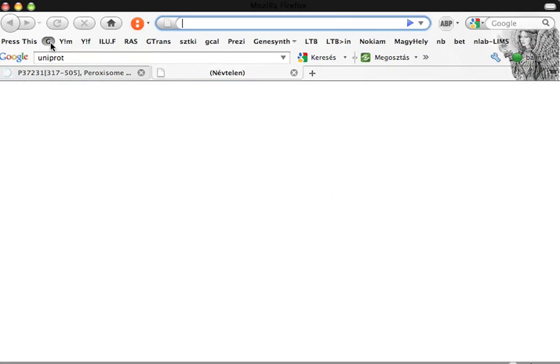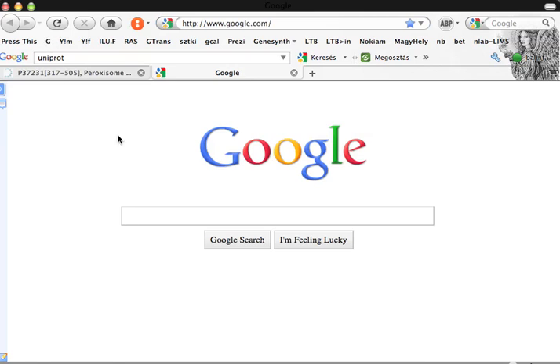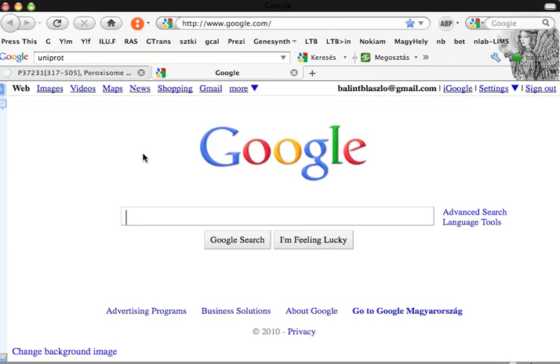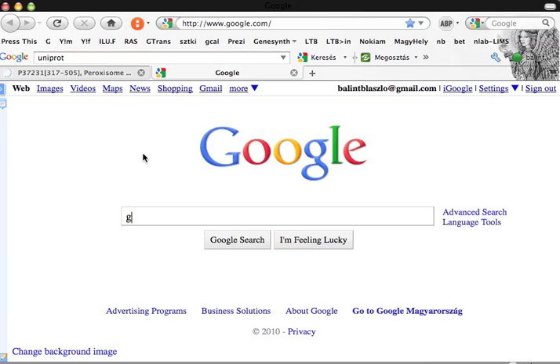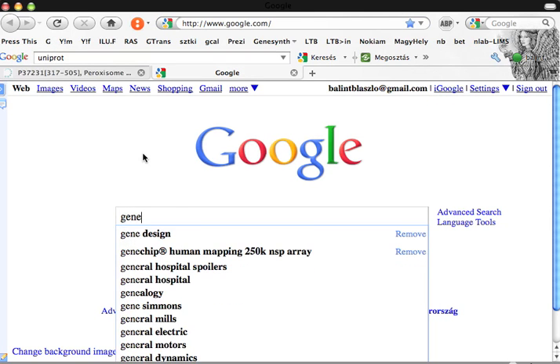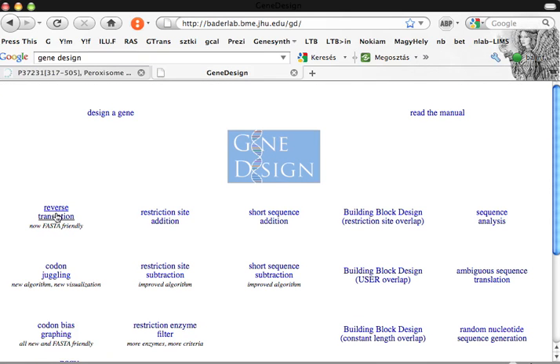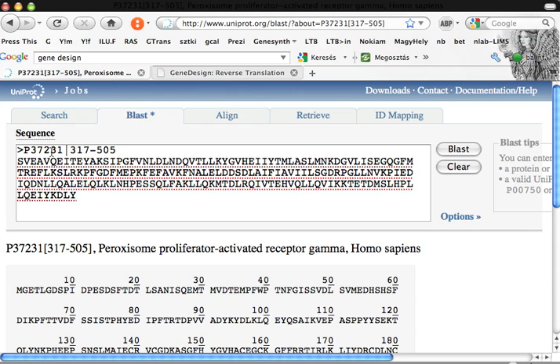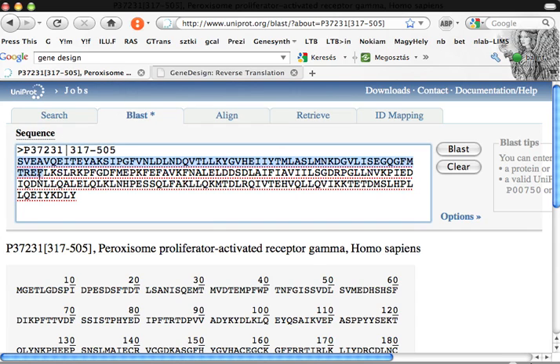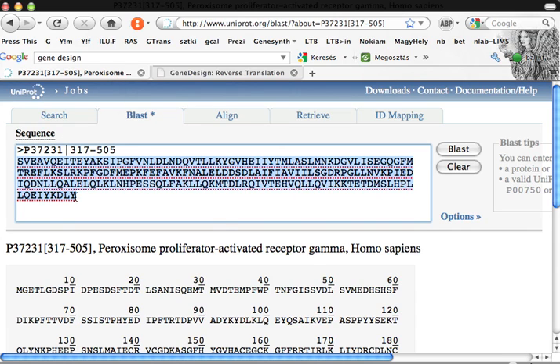For this, let's go to gene design. Here you see gene design. We will use reverse translation. So please copy paste this sequence.